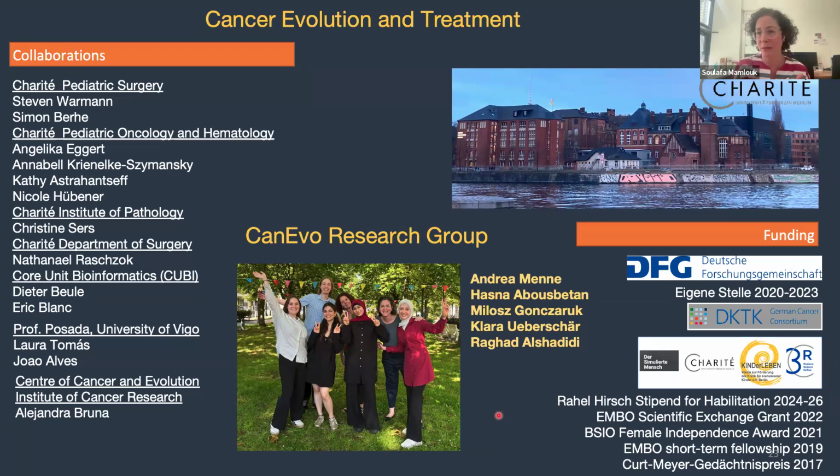There will always be that problem, but they grow fast, they grow from the patient, and maybe neuroblastoma not, but others really represent this 3D organization. So the cell-to-cell contact, you're getting a lot of information using these organoids, but they will lack a lot of information from the microenvironment.